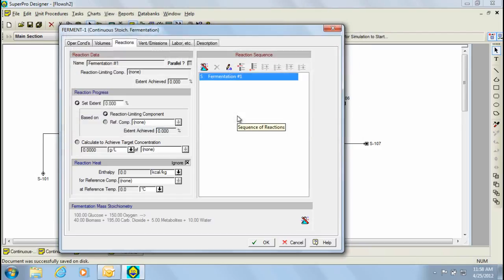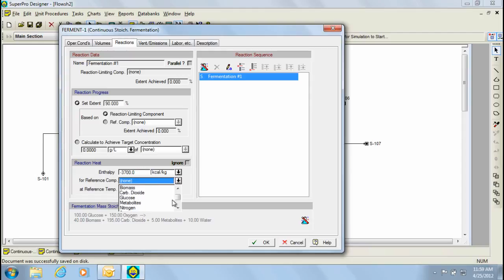Next, I need to specify the extent of the reaction, which is going to be 90% for this example. Also, I'm given the option to ignore or include the reaction heat. For this example, we're going to include it, and it's going to be minus 3700 kilocalories per kilogram for the reference component of oxygen at a reference temperature of 37 degrees Celsius.